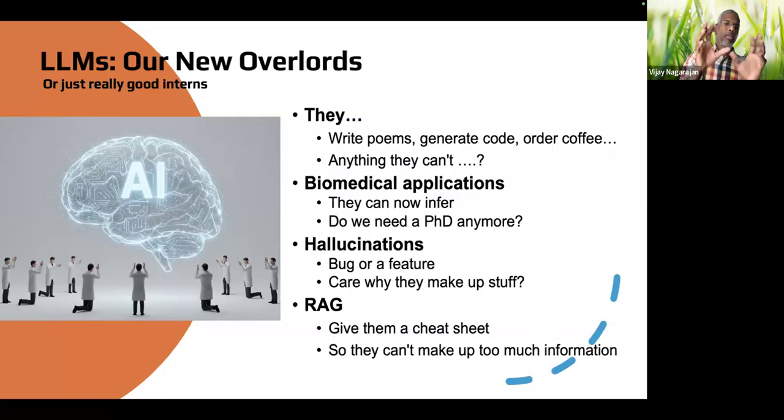So this is about the LLMs. Having understood the LLMs, and given our existing problem of single cell analysis, I tried the chat windows and pretty quickly hit a wall: this is not the way I want it to work. It was very inefficient. Then I hooked up Gemini to R, integrated it, and built it into a standalone application that everybody could use. So that's the bigger picture.